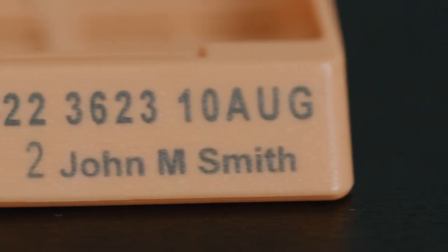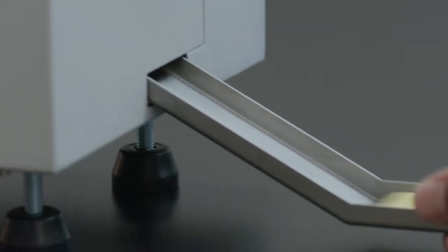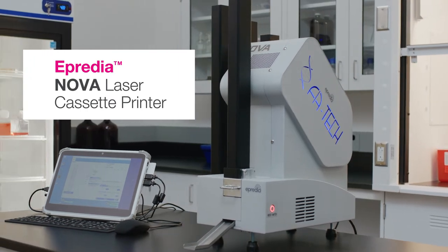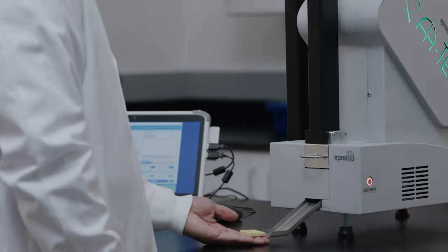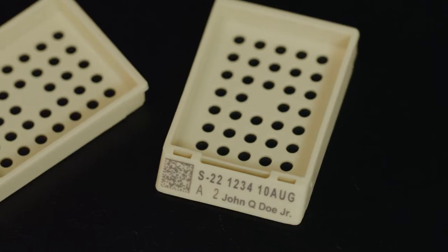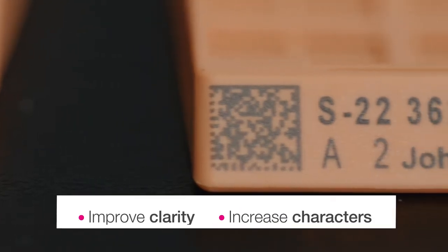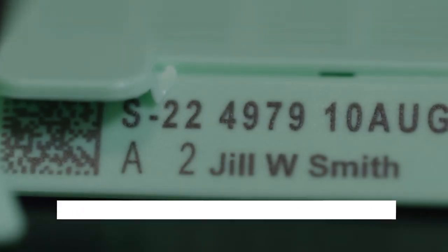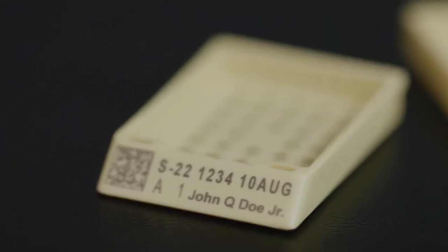Comprehensive sample identification demands advanced printing capabilities. The Apredia Nova Laser Cassette printer offers the high-resolution printing you need for labeling and identifying precious tissue samples. Its 600 DPI printing improves the sharpness and clarity of characters, allowing more characters to be embedded and maintaining legibility from grossing through archiving.